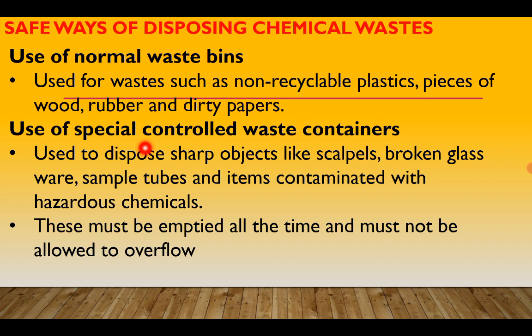The second way to dispose of chemical waste is the use of special controlled waste containers. All right, you also have these strategically placed in the laboratory at one designated corner. As these wastes are being generated, you collect them and dispose of them in such containers. These are used to dispose of sharp objects like scalpels.